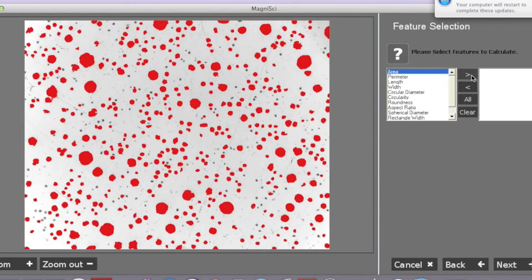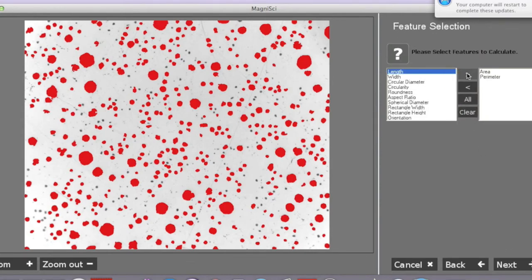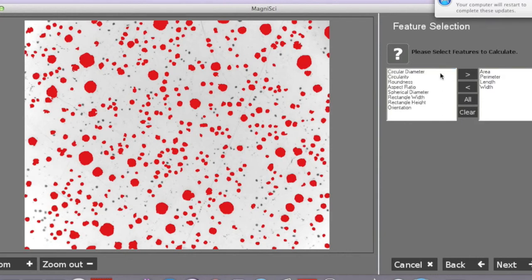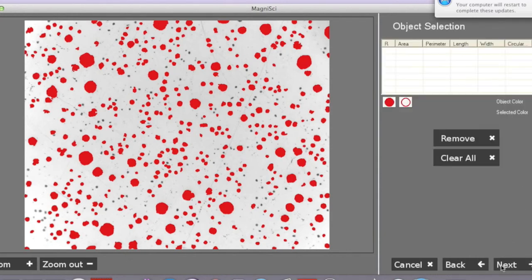We then select how we want the particles to be analyzed. Our last step will be selecting the particles we want.